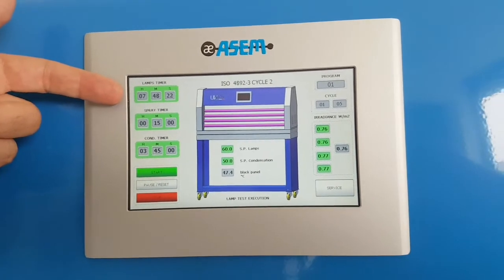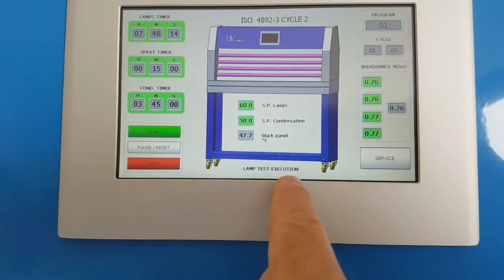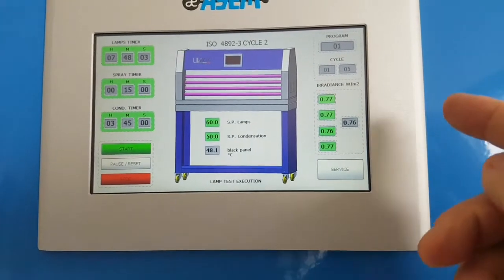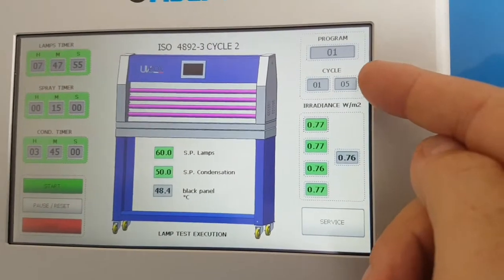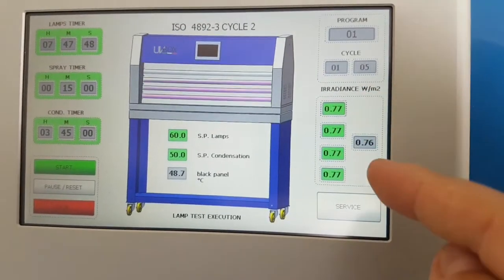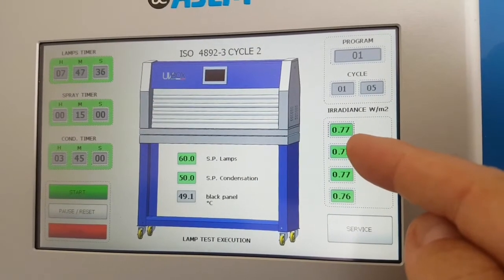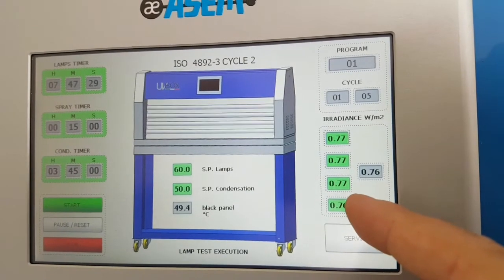You can see exactly what the chamber is doing — in this phase it is in the lamp phase. After the lamp test execution it will run the spray phase, and then the condensation phase. On the other side of the panel you see the program number — in this case program number one — the number of cycles set to five, currently running the first of five. Here you have the irradiance values: the first two lamps on the front, the second two lamps on the front, the first two lamps on the back, and the second two lamps on the back.